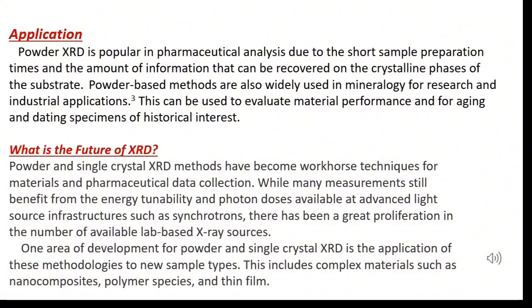At first, applications: powder X-ray diffraction is popular in pharmaceutical analysis due to the short sample preparation time and the amount of information that can be recovered on the crystalline phases of the substrate. Powder-based methods are also widely used in mineralogy for research and industrial applications.